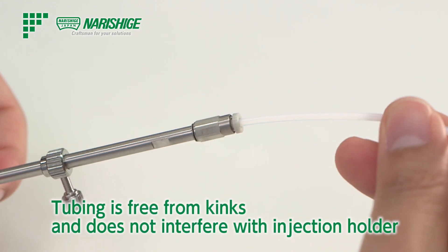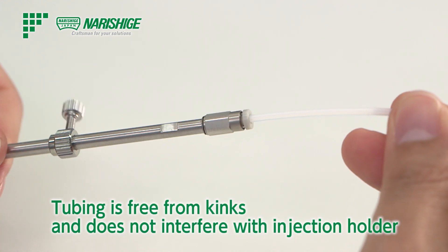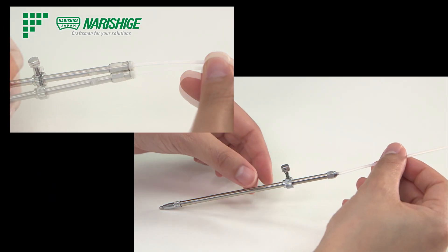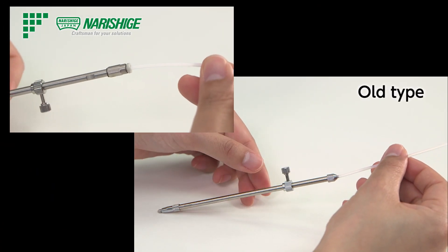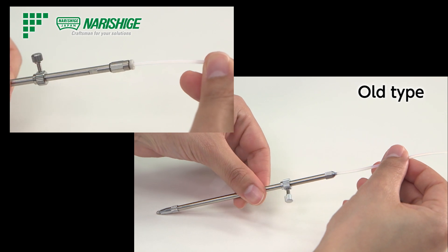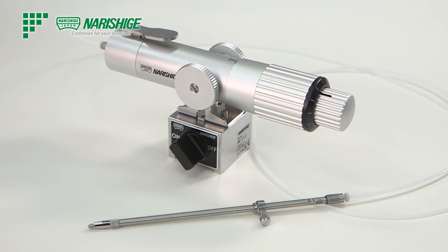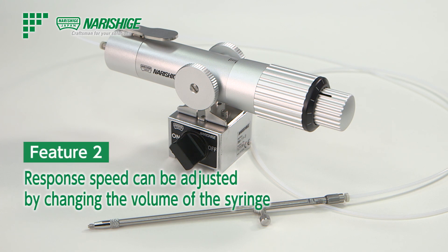This mechanism eliminates kinks in the tubing that could force the pipette tip to be unexpectedly rotated. Another unique feature of this injector is that the syringe volume can be changed to adjust the pressure value of the pipette tip.